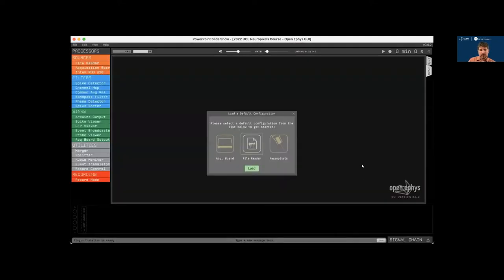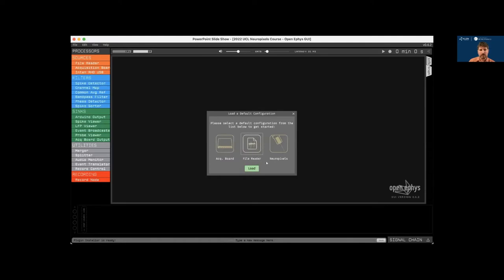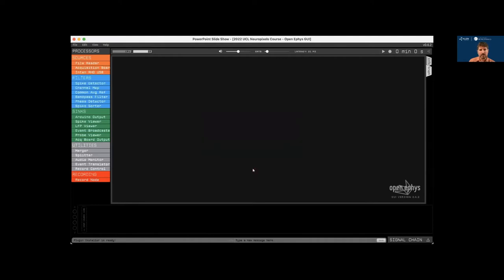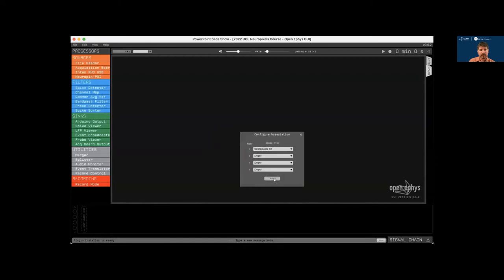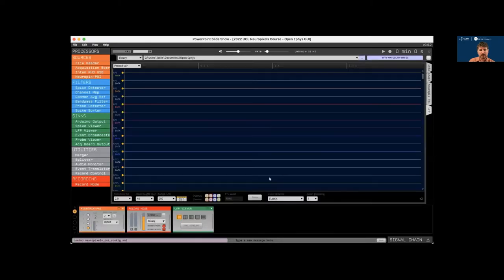So when you launch the GUI for the first time, it displays a pop-up window that allows you to select one of three different default configurations. There's one default configuration for the OpenEphys acquisition board, one for reading pre-recorded data, and one for Neuropixels probes. When we load the Neuropixels configuration, it automatically downloads and installs the Neuropixels PXI plugin, which now appears in the processor list on the left. And we don't have Neuropixels hardware hooked up at the moment, so we're going to run the plugin in simulation mode. So click yes here.